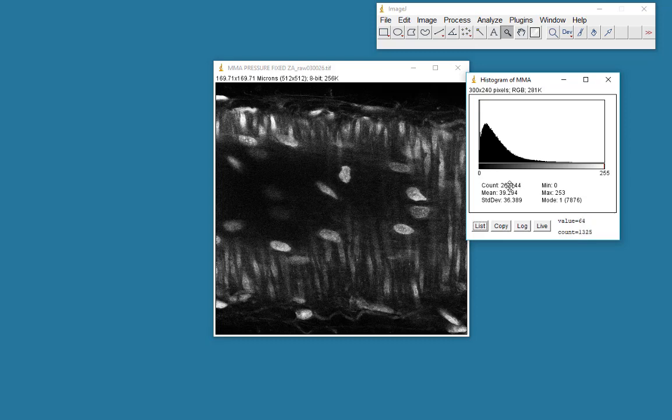As I mentioned earlier, there are 262,144 pixels in this image, which is shown here. And the mean intensity of all of those pixels is 39 plus or minus 36, which is our standard deviation.